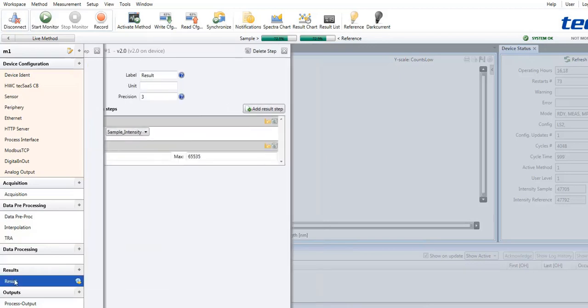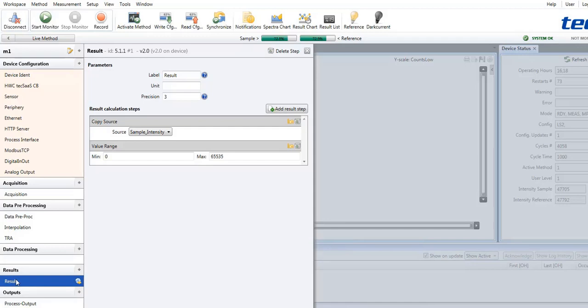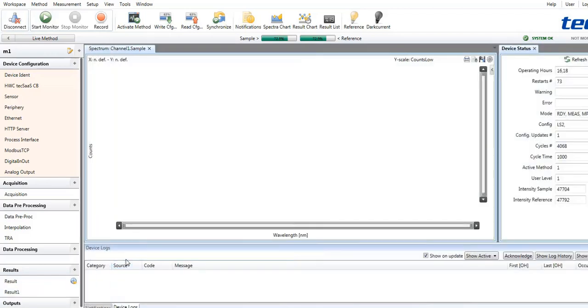Finally, the results allow you to define various output parameters calculated from the spectral data. Typical examples for this are transmission or reflection values at a specified wavelength. Alternatively, you could also show a system temperature or the current CPU temperature.